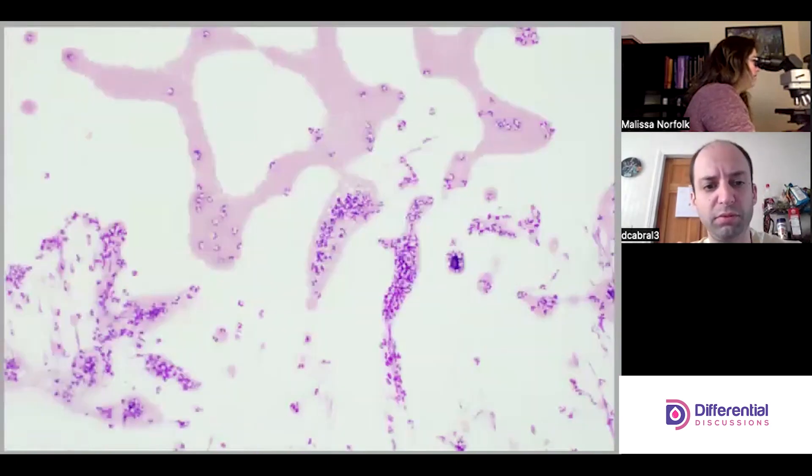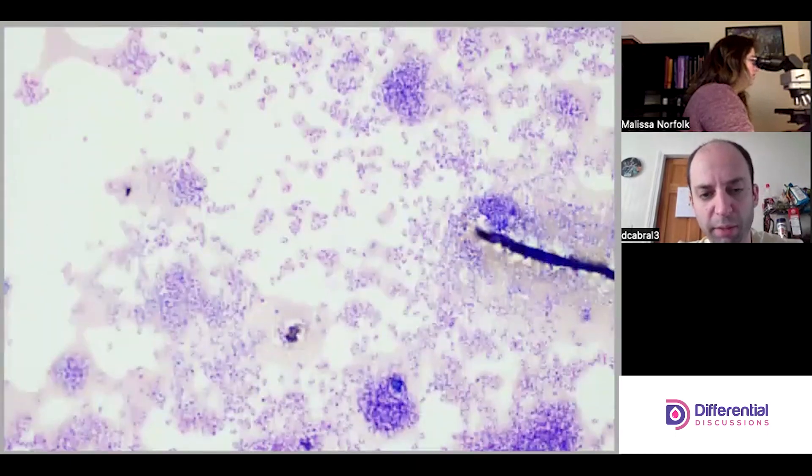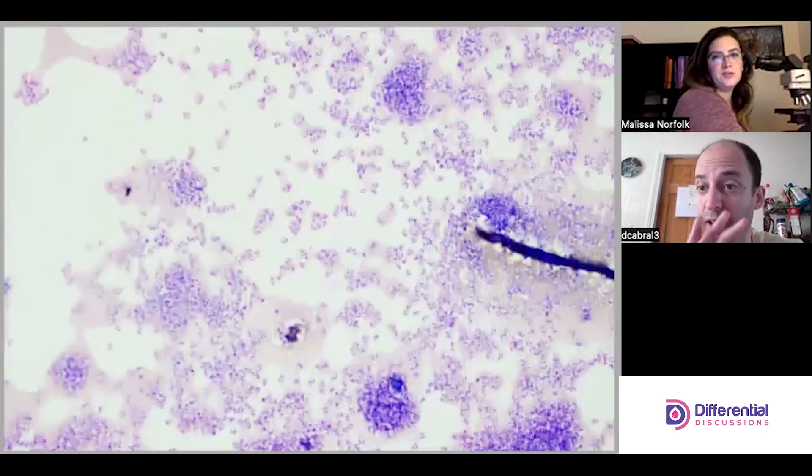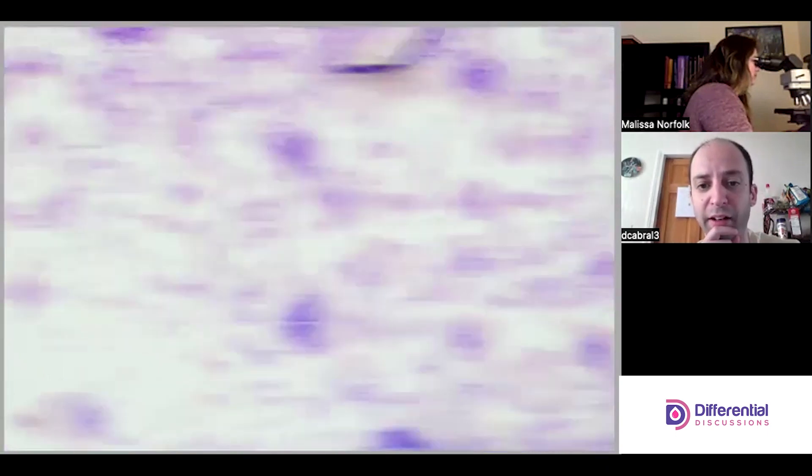I don't see any areas that are super exciting to jump to. I don't see any ugly big cells, which makes sense for a synovial. It looks fairly homogenous — we can't really pick a bad area.